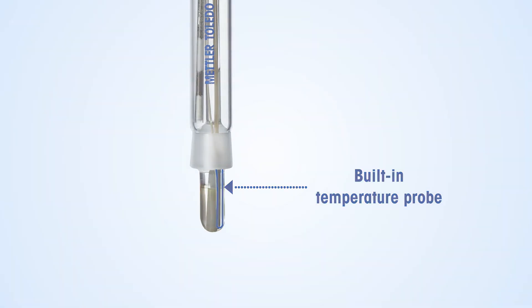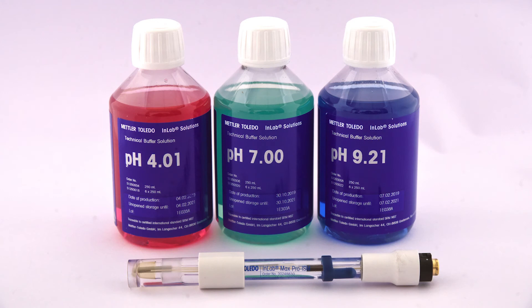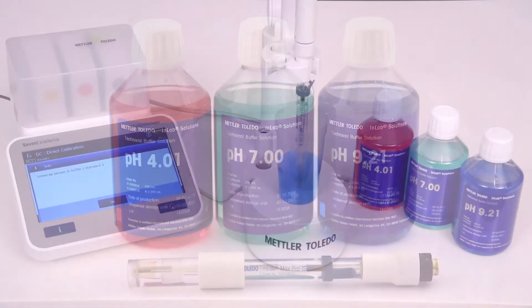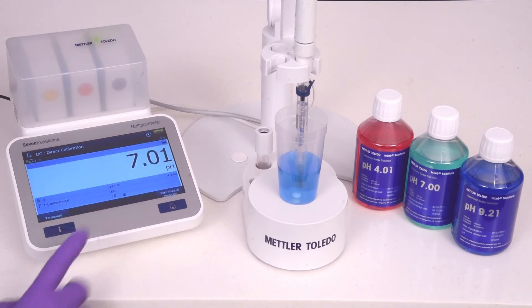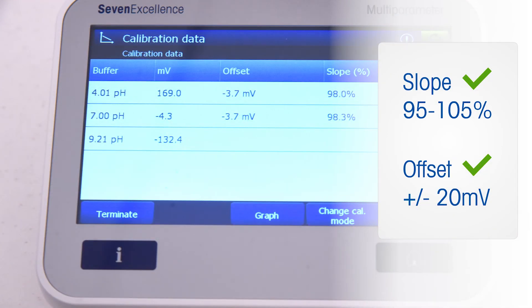Since pH is temperature dependent, the integrated temperature probe notes the sample temperature. Calibrate the electrode with pH buffer solutions from Mettler Toledo, using buffers to bracket the sample pH range. Gentle stirring of the calibration solutions or samples with the U-Mix magnetic stirrer ensures homogeneity and quick response.